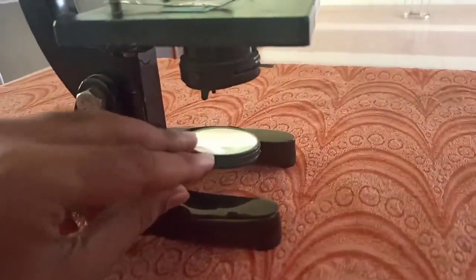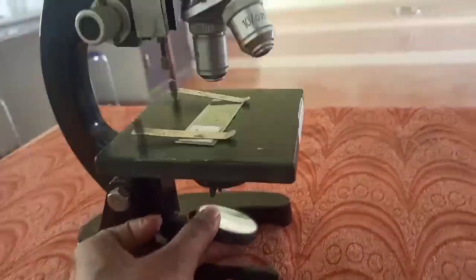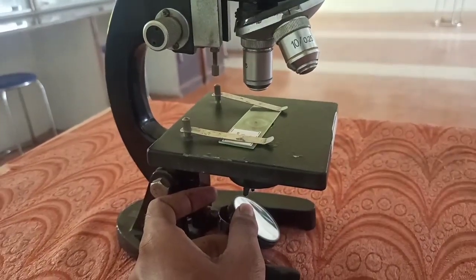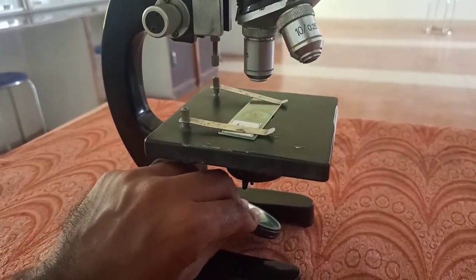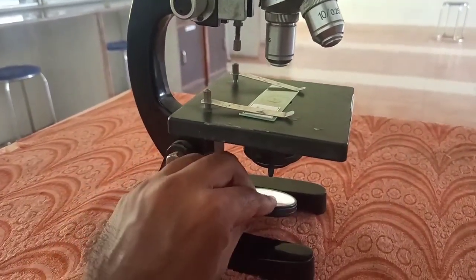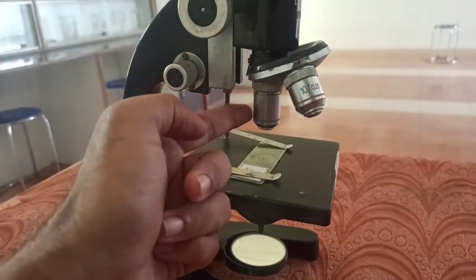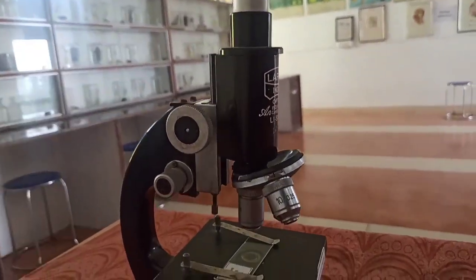One of the important parts you can see here is the reflector. What is the function of the reflector? Light rays are incident on it. So the image will get reflected and it will fall in this hole. Through this hole, it will fall on the object on the slide. Then the image will be formed by the objective lens, and through the body tube in the eyepiece or ocular lens, the image will be visible.